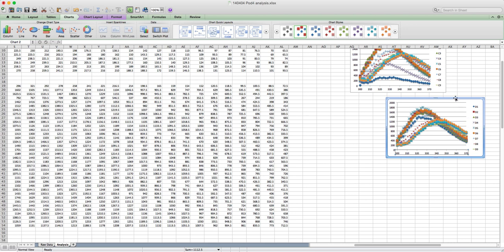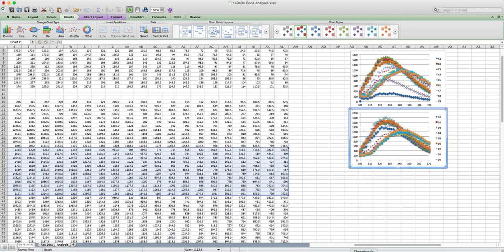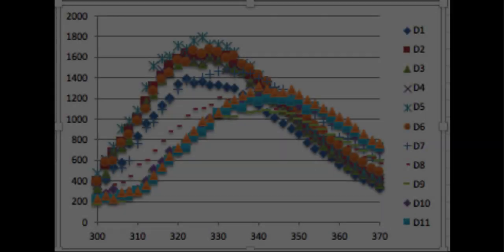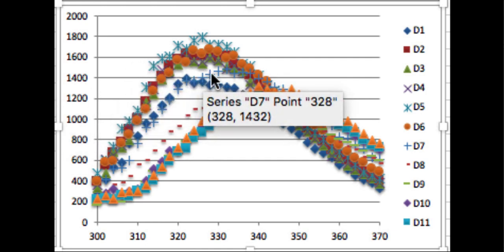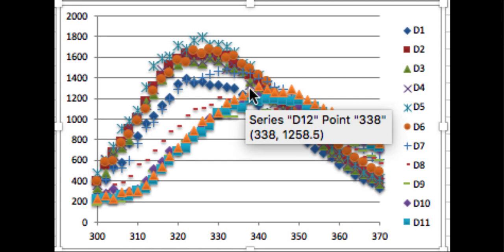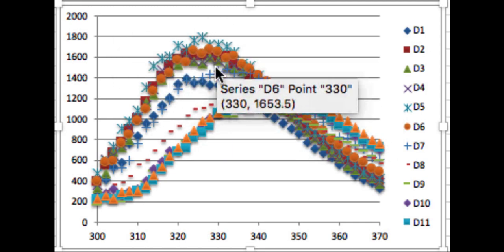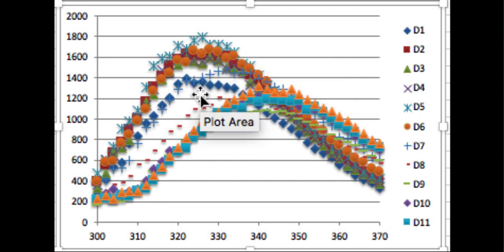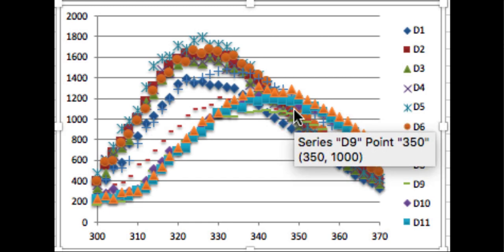The other thing you should see is a difference between folded and unfolded. Let's take a quick closer look at one of these curves. Remember, what we're trying to do is use the shift in these peaks to measure the folding to unfolding transition. In looking at our data, we can see a nice peak here corresponding to folded protein, and a nice peak over here corresponding to unfolded protein.